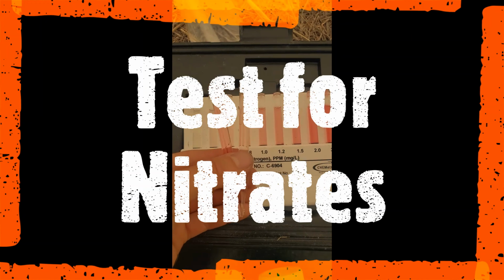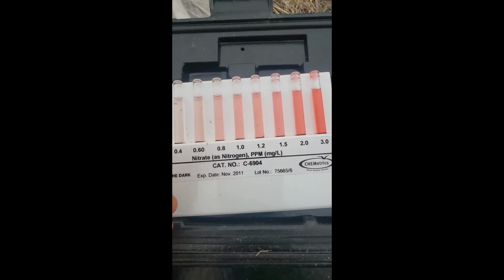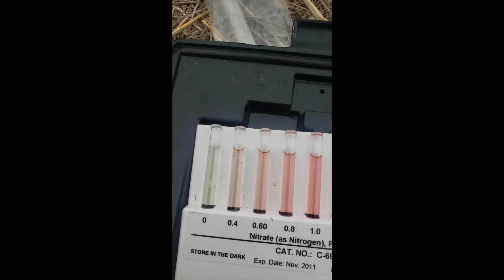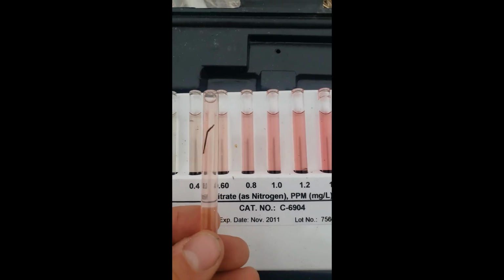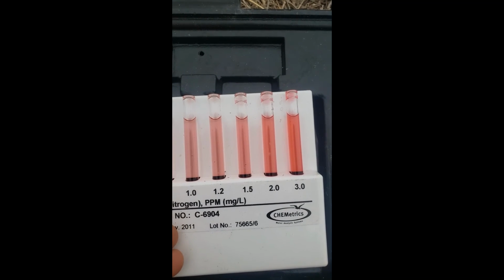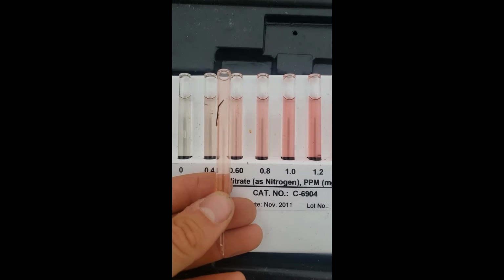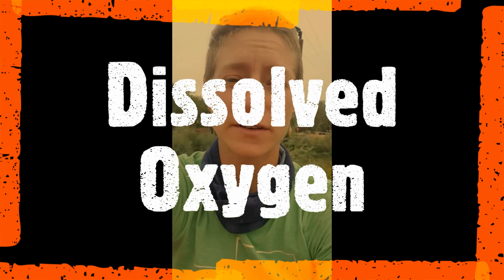Okay, so here on the left is from the pond sample, and the right is the river. So let's go ahead and do the pond. We'll do the pond first. We'll measure it up against that. Going around each one and seeing, for me it looks like this would be about 0.6. I think it matches best with that one. Right around 0.6.